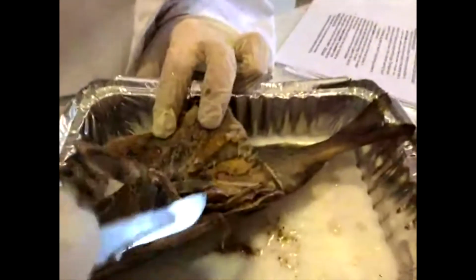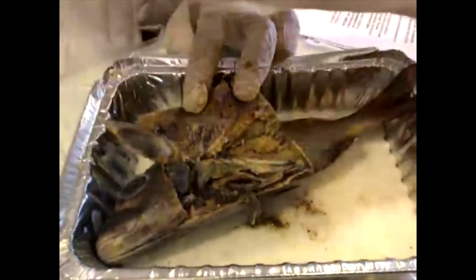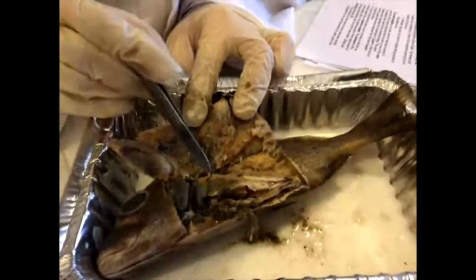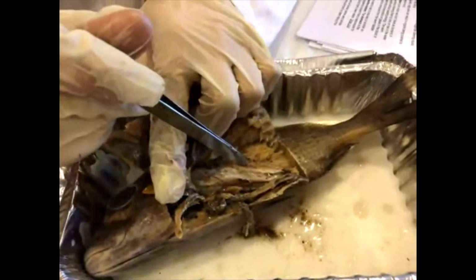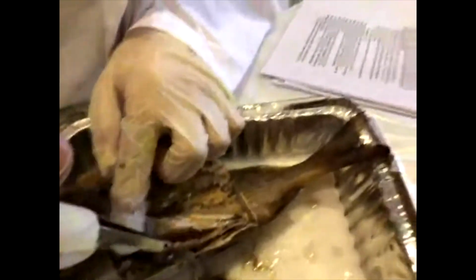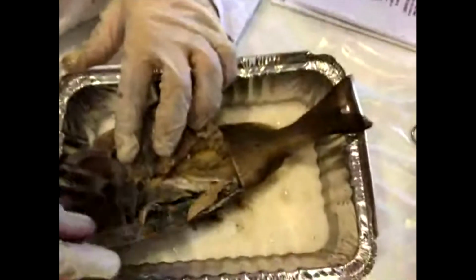So just as a quick review, I think this is another kind of stomach sac, but it isn't filled. We've got our swim bladder along the back, this big white organ. We've got our liver, the lobe up front here. We've got a stomach underneath with a few different blobs. And these are called the pyloric ceca, which really means stomach cavity. So these are like little stomach compartments. And then we've got our intestine running along the bottom. And don't forget, we had our testes laying on top here. But again, those might be hard to draw because we've removed them. And if you want to draw the intestine behind there, you wouldn't be able to see them.